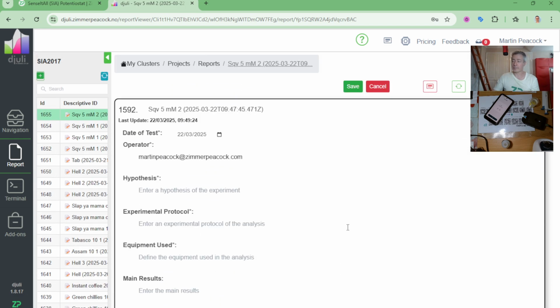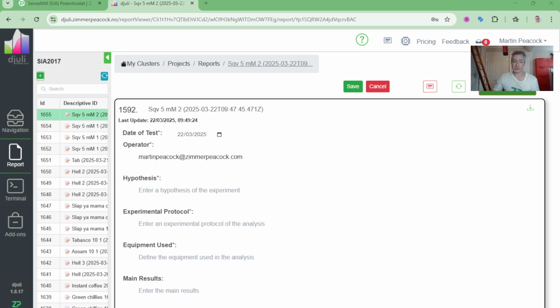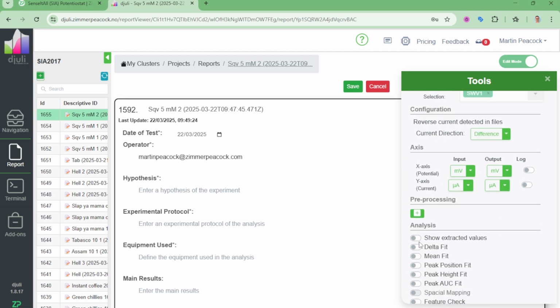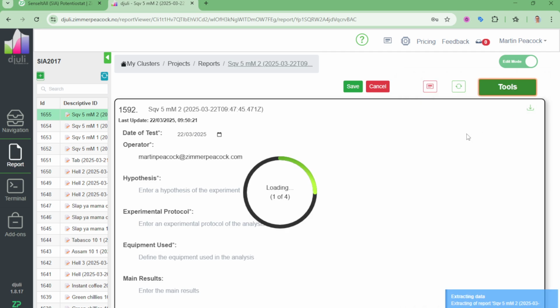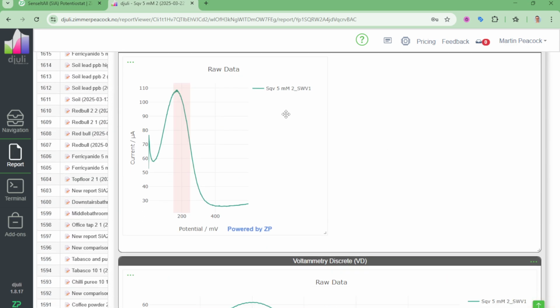What I can also do, what's very powerful about this system as well, is I'm just going to turn off this for a second and just go down to, I'll just turn this off as well. I can actually turn that raw signal, let's say I go to VD1 here, I'm just going to say show extracted values, and I'm going to find the peak height. Now I'm going to look for the peak height at about 200 millivolts, and I'm going to put a window around that, 100 millivolts. This is why this system is very cool, because if your peak shifts around a little bit, it doesn't matter. We can still find the peak height.